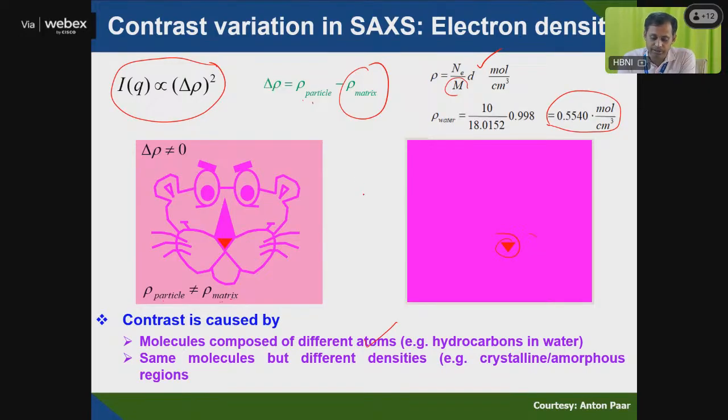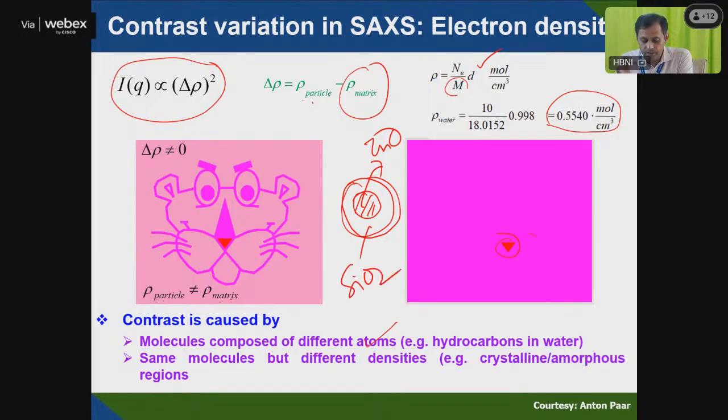If you simply see it in a transmission electron microscope, you can compare, for example, a core-shell structure. As you know, if the core is made of zinc oxide and the outside is silica, SiO2, then in a TEM image you will see that the core is highly dense and the shell is lighter in region. This is because of the high Z material, so the contrast of the shell and core is different. You are able to see the core-shell structure in mass contrast in a transmission electron microscope.